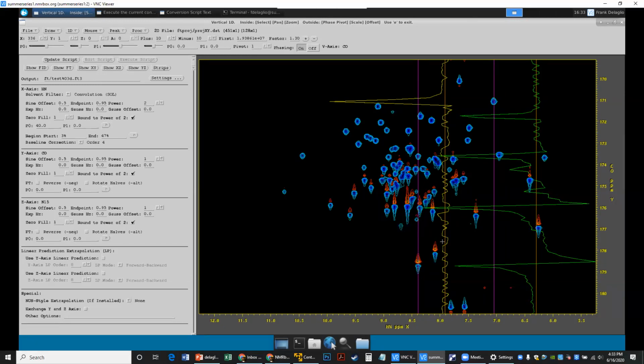To choose phase correction parameters for data like this, we start by positioning a pivot point. And so the window tells me I can use the leftmost mouse button outside. And if I move the leftmost mouse button, you might see there's a pair of very small arrow cursors. So that's the pivot point. I will point the pivot to one peak in the data, like this one here.